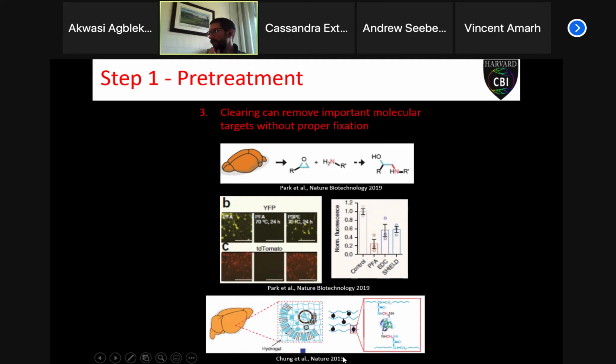Another method that's very popular in tissue clearing is to embed the entire sample in a hydrogel. So this is usually an acrylamide gel. We allow that gel to impregnate the tissue, and then we cross-link our protein onto the gel. This is a way to specifically retain protein. The lipid molecules will not cross-link to that hydrogel, and this allows our delipidation process to work better. We can be really harsh when we're trying to pull that lipid out because it's not attached to that hydrogel, and our protein will stay behind under those harsh conditions.